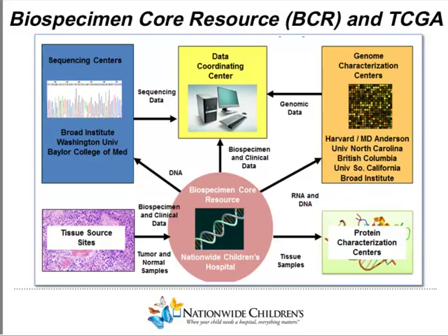And so TCGA, if you're not familiar with that, is an NIH-funded consortium of basically an international collection of tissue source providers, so groups around the world that are providing tumors to this project that channel through our BCR as basically a regulator of checking the quality of these samples and the consistency of these samples with their stated histological diagnosis.